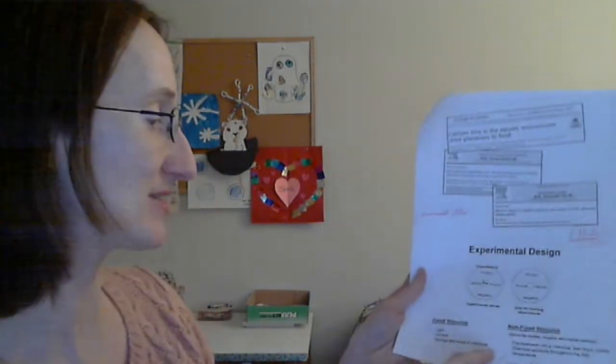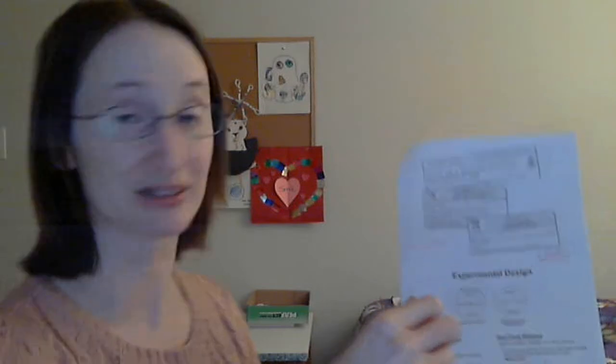So if you're thinking of a fixed stimulus, you could use that example of a sponge saturated in chemical. You could use current. You could use a light source and shine some kind of light in a certain spot and say, do the worms move towards it or away from it, or not at all? If they don't move at all, it might be dead, so look at any worm. But if they just seem to be moving randomly, it could be that whatever your stimulus is doesn't have a true effect. So you could have a fixed stimulus.